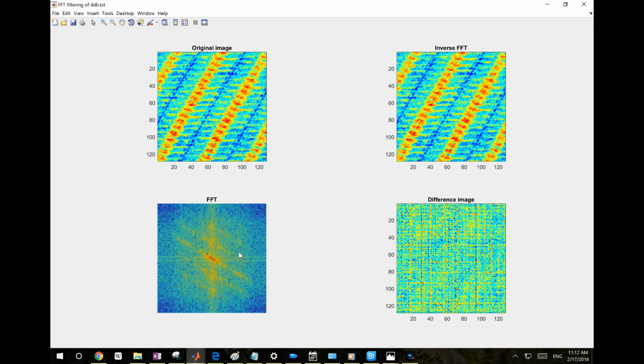You can mask the region that's not periodical, with low background frequency and noise, and only use the region of high signals in the FFT to do the inverse FFT.